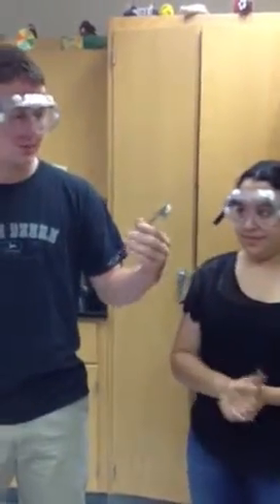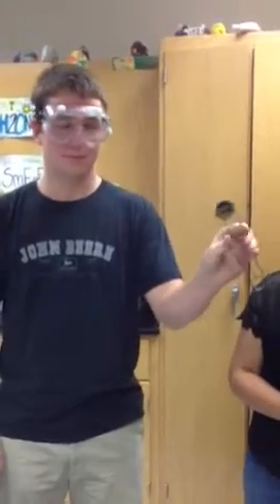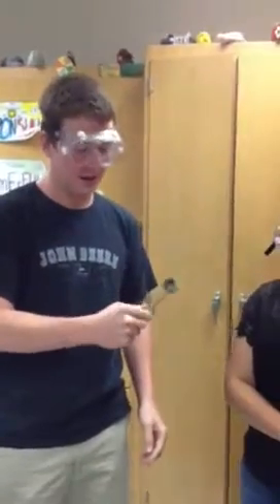Alright, this is a striker. In order to use it, you must squeeze it. Spark it there — like that.